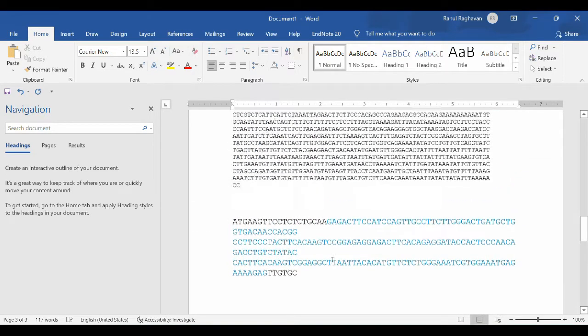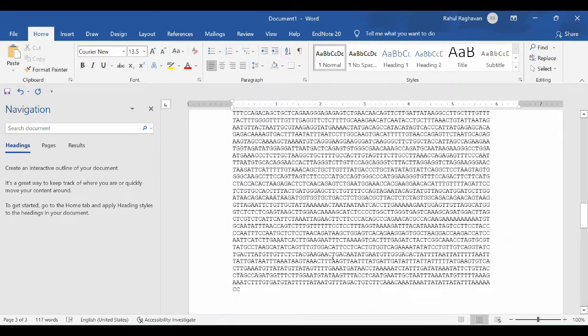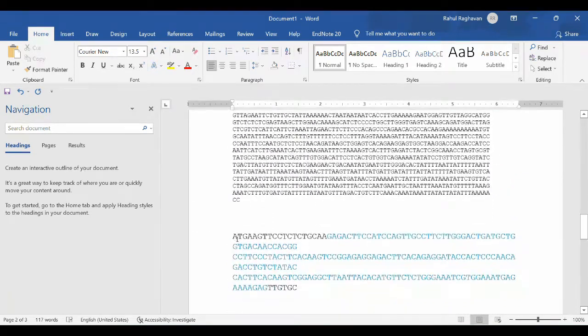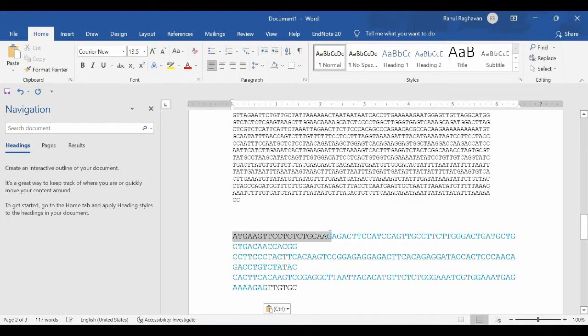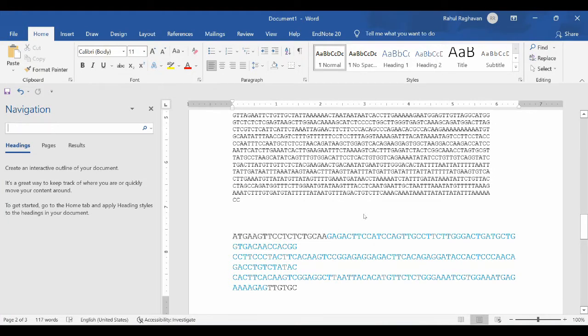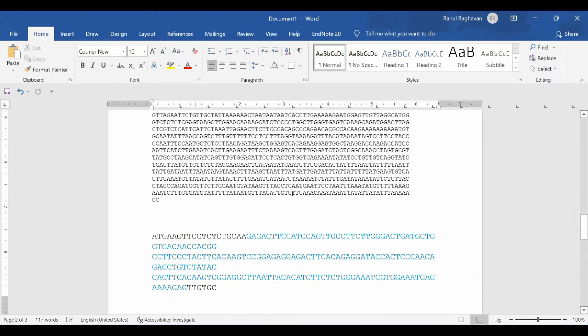I have both sequences taken from the different databases. The upper sequence is from the NCBI and the lower sequence which is shown in the blue and black color is from the Uniprot.